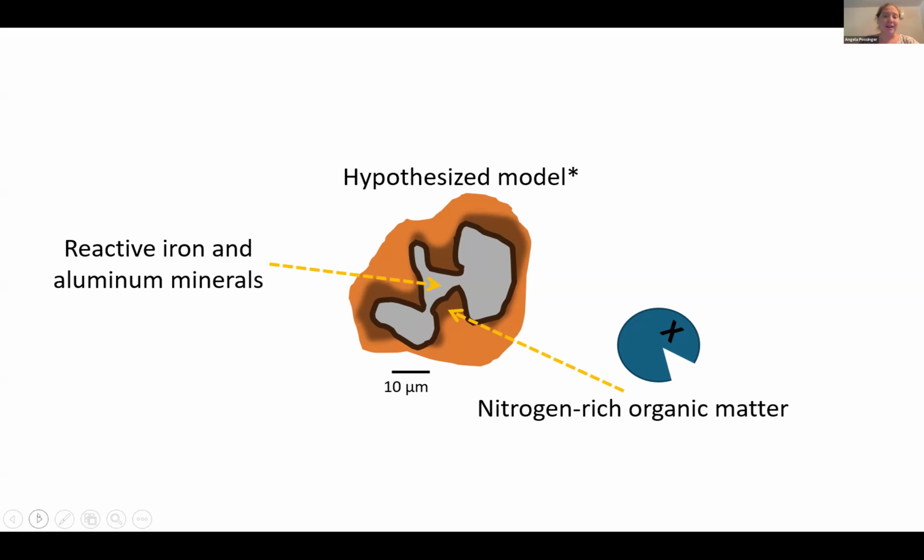For soils, which are definitely not uniform crystal type materials, we were aiming for 0.1 to 1 nanometer spatial resolution. And combined with this really high spatial resolution, we also have the ability to probe carbon composition, because EELS is a technique that measures inelastic scatter, which is related to the bonding environment of elements in the material.